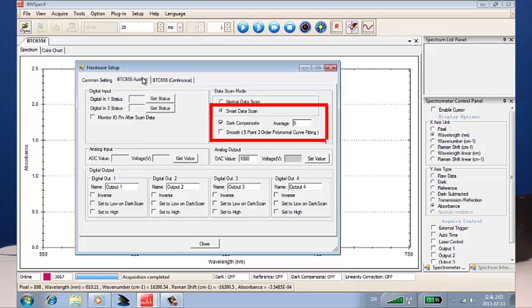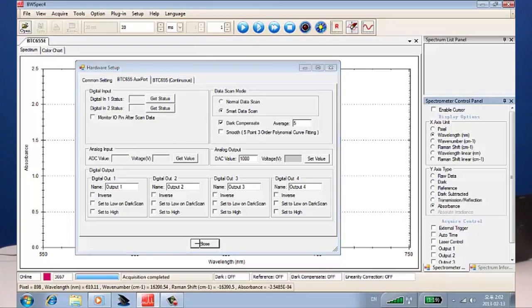Now, the cool thing is it also does averaging — you can determine the number of averages — and smoothing. So now we have all three of these capabilities built in, and it's doing that as it's collecting the data on board. Since we're doing the number of averages on board, that increases the signal-to-noise ratio as well.